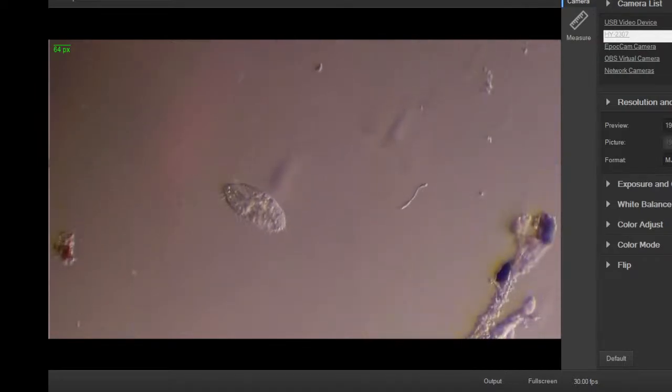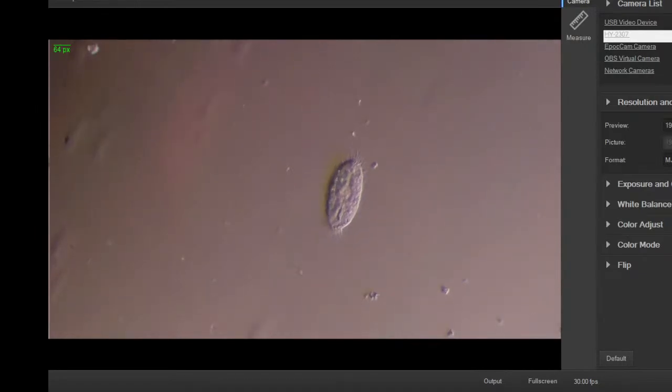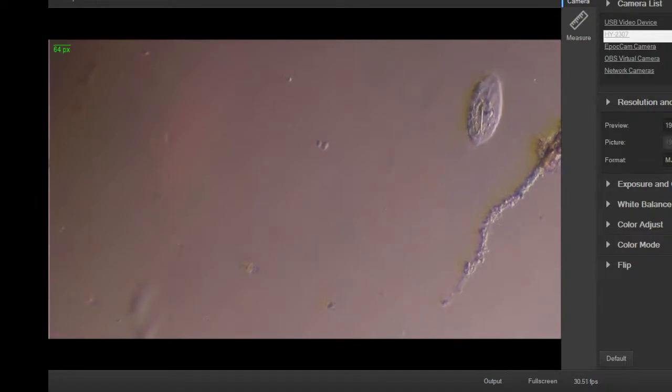Not only that, but it's giving me this pinkish halo on the left side of the frame. It's some kind of weird internal reflection. I can't get it to go away, so I put up with it for a while. It's really getting on my nerves, so I'm going to have to get a much better camera. Also, with a better camera, I can do live slow motion for some of these fast guys, and also little structures going in slow motion. You can see them much better. And so it'll be a much better experience with a better camera. Get a wider field of view, all that kind of stuff.